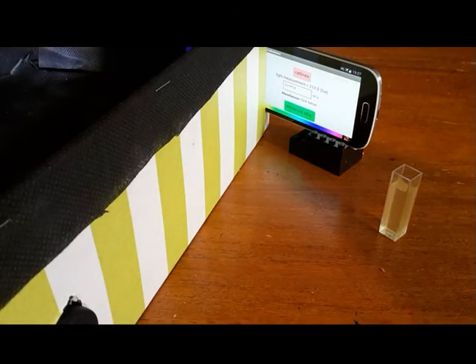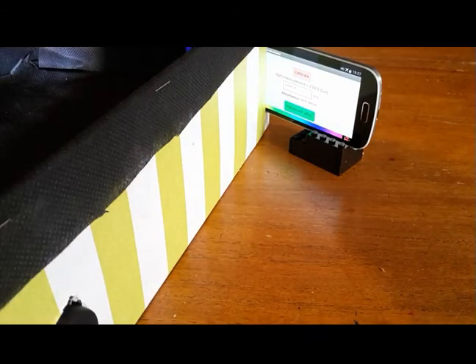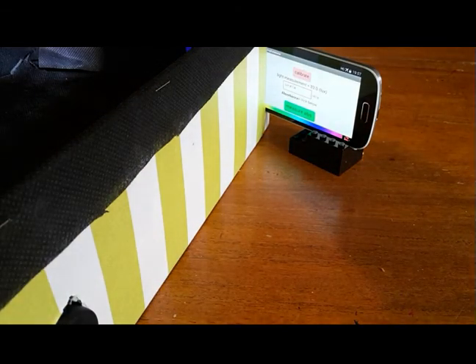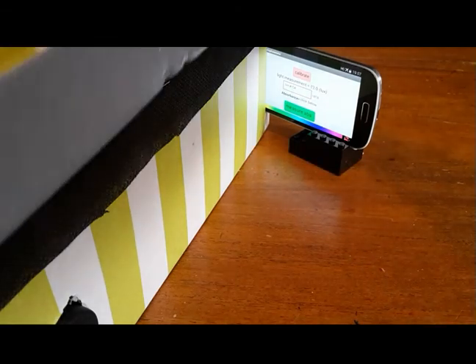Next I'm going to put the sample in. So take the blank out, put the sample in, close the lid, and then I'm going to press measure.